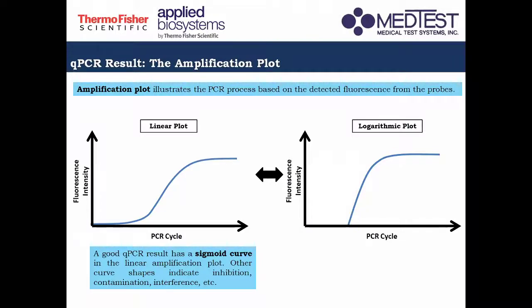Now, your PCR run in a real-time PCR instrument should look like this. So this is like an ideal amplification plot of a good PCR run.